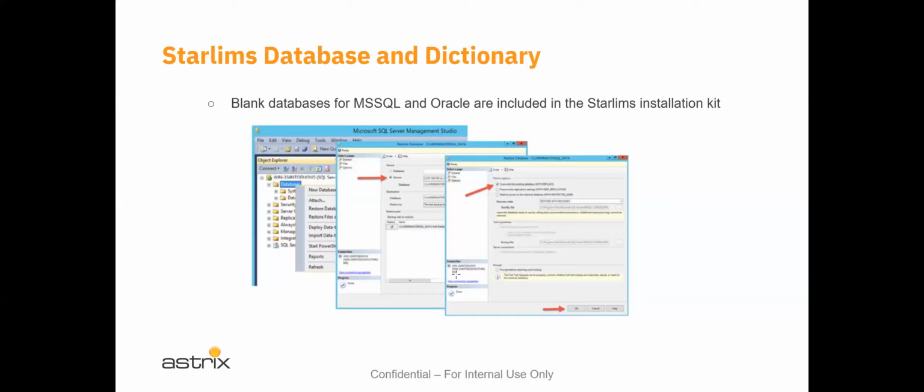So you're going to be getting to know how to operate STARLIMS at the toolbox level. And then you're going to understand, as you mature with your education and experience with STARLIMS, that different versions of the software have been modified to create functionality specific to those industries. So there are folks out there that know quite a lot about the pharmaceutical and the forensic models, for example.